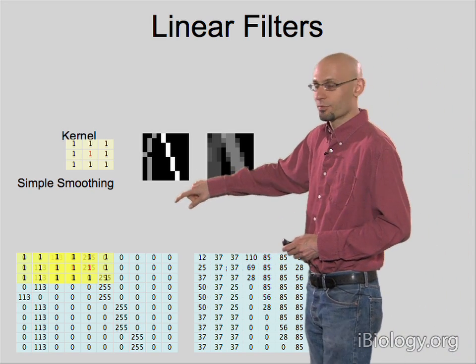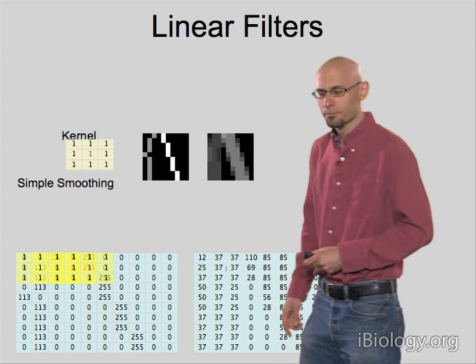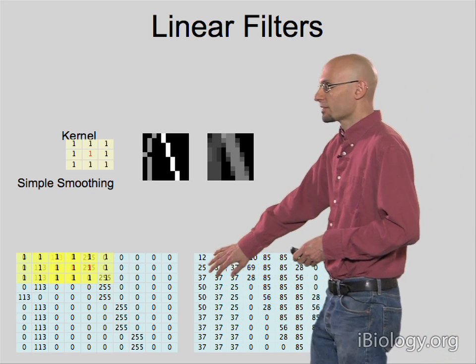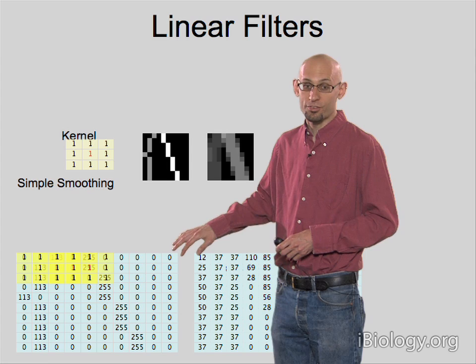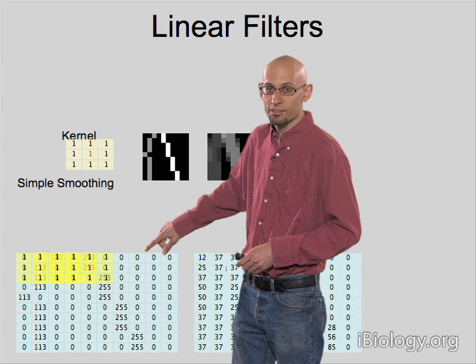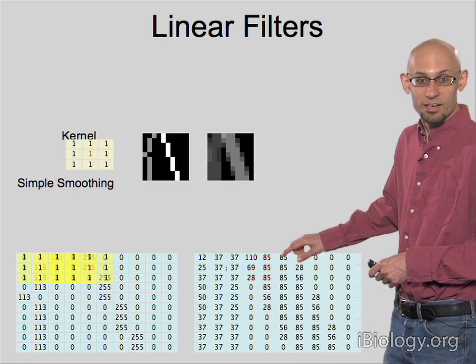We're applying this 3x3 kernel here, and so if we want to filter something in this top edge here, we need to figure out what the numbers up here, one row above that edge, should be. And obviously, there aren't any numbers there. There are a number of different approaches that people commonly use to deal with this. The simplest is probably just to assume that any numbers outside of your original image are 0. But equally, you can generate those numbers by taking this top row and duplicating it, or wrapping around so that the top row is connected to the bottom row. And then you would get your numbers from there. And I think that's what was done here.